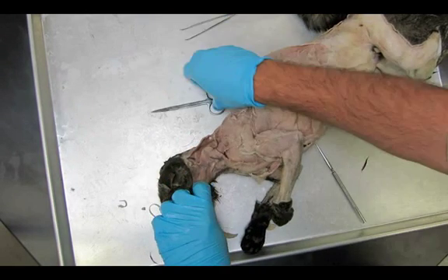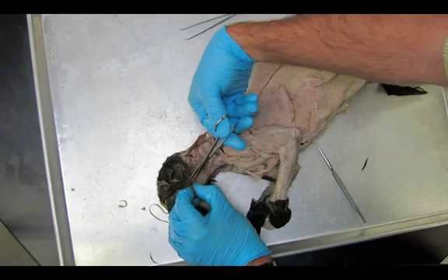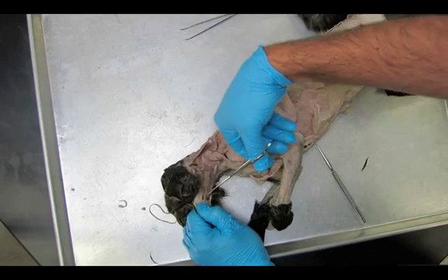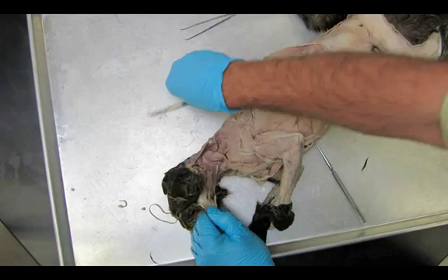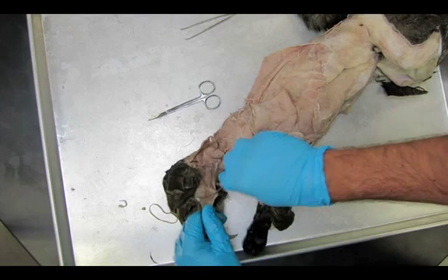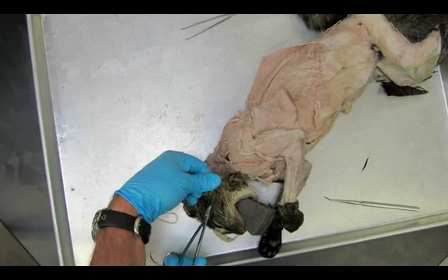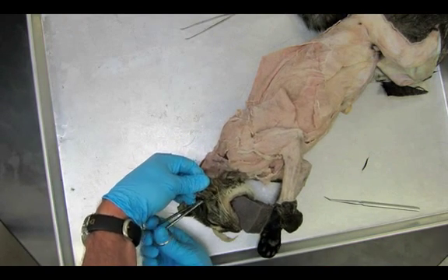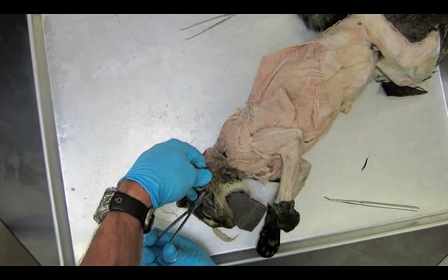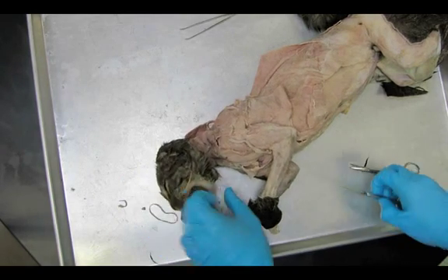I'm going to use my scissors and my blunt probe, cutting and exposing as much fur as I can around the jaw and the chin. Don't be too concerned about going too deep. When in doubt, leave the tissue on the cat — don't let it come off with the skin. There's quite a bit of connective tissue that separates the muscles from the skin. There's also some glands and lymph nodes that we're just going to remove.